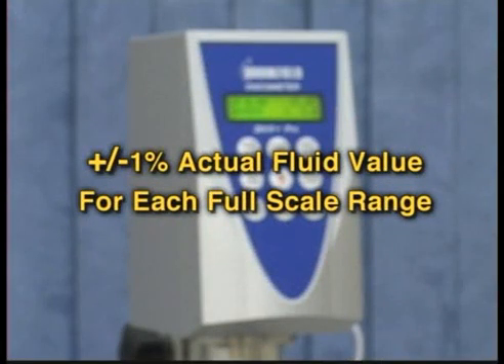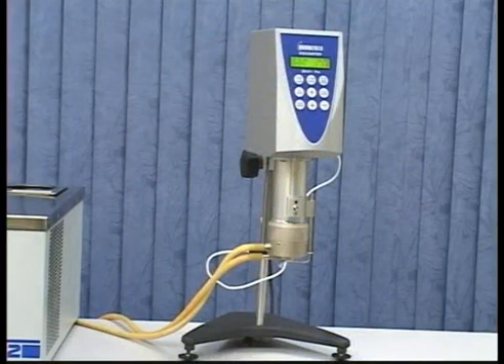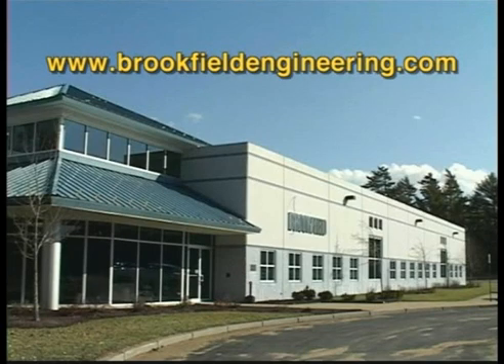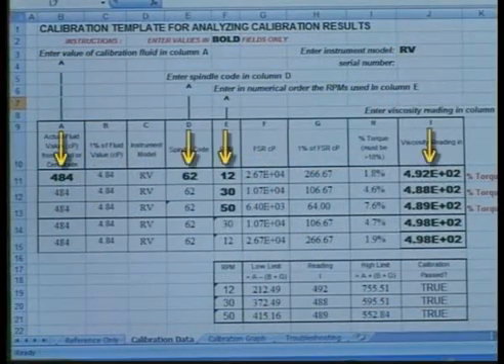Tolerances for calibration are computed using plus or minus 1% of the actual fluid value for each full scale range. You can perform a calibration check manually and enter the values to compute the tolerances for pass-fail criteria. Brookfield supplies a calibration worksheet on their website that easily allows you to enter data, computes the tolerances for each range, and gives pass-fail criteria automatically. You can download the calibration worksheet from Brookfield's website at www.brookfieldengineering.com. Going to the link on your screen will take you directly to the calibration worksheet.